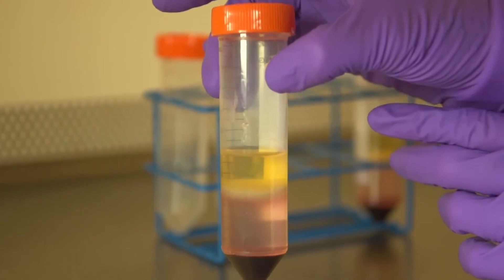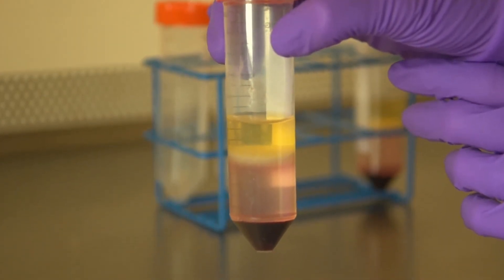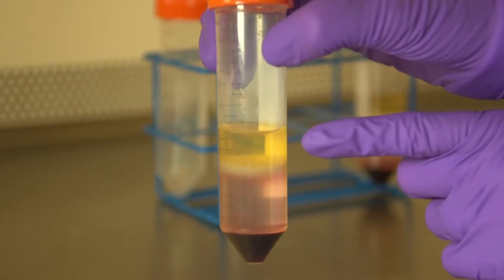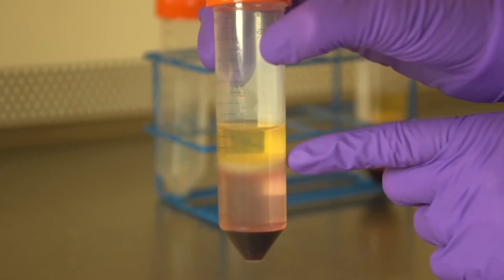This is what your sample looks like after centrifugation. Blood is separated into its constituent parts: plasma layer and fine layer of white blood cells.